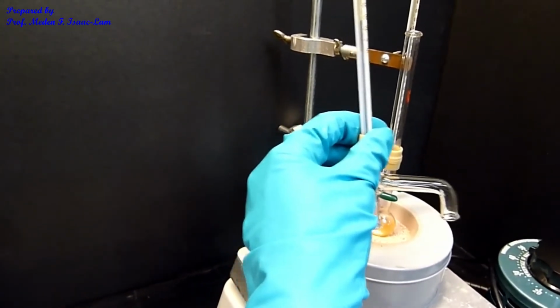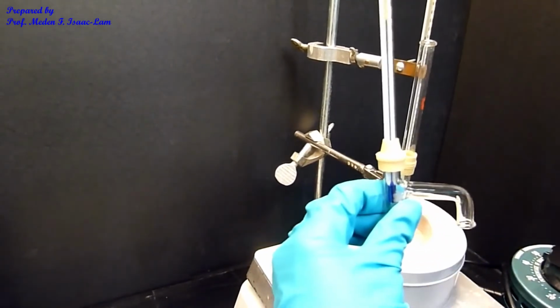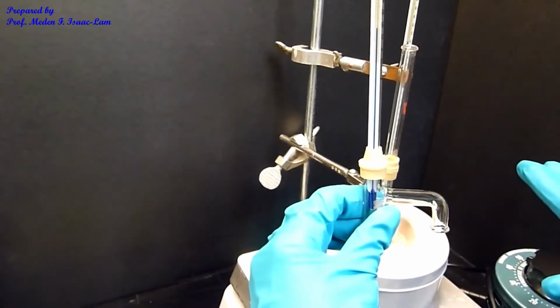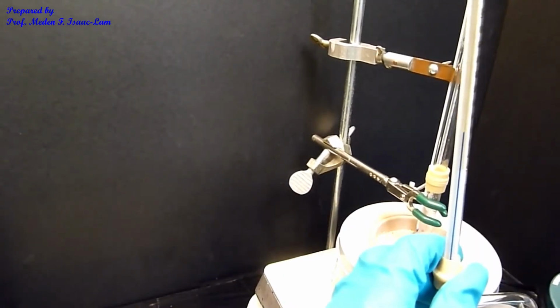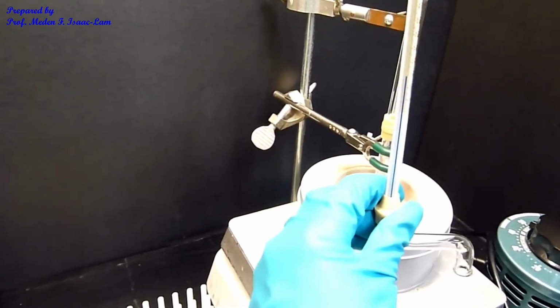the ester. So this is a partial kind of purification. We want to isolate the ester, so it's basically by boiling point. We also want to not take the Dowex, so we want the Dowex to remain in the flask.